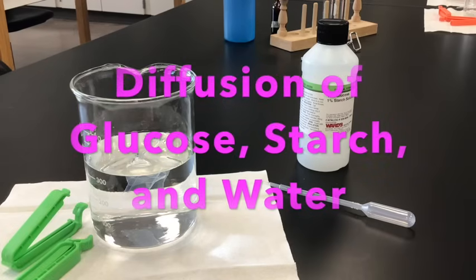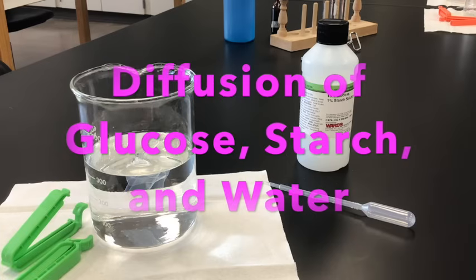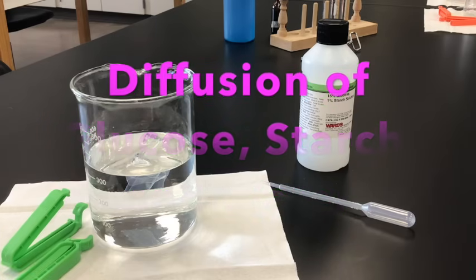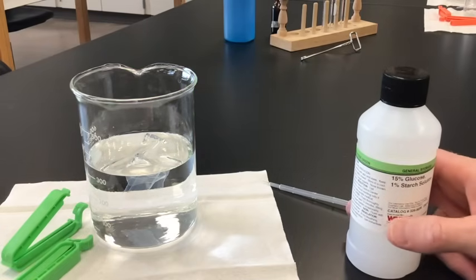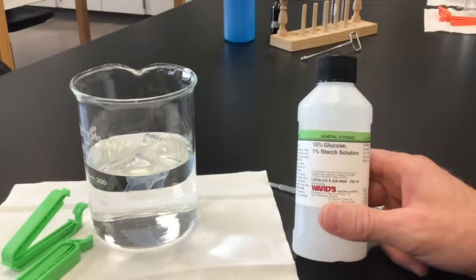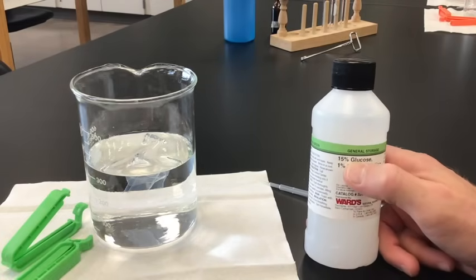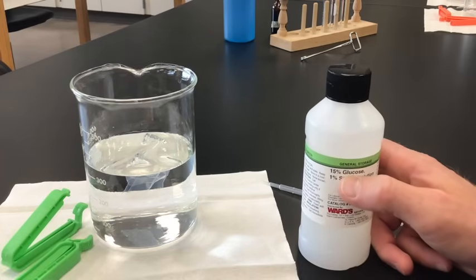Hello and welcome. This is Mr. Buss. This video is going to go over Part A of the Diffusion Lab for AP Bio, where we're going to take a look and see how glucose and starch behave. This solution here has 15% glucose in it. Remember, glucose is a monosaccharide, C6H12O6.